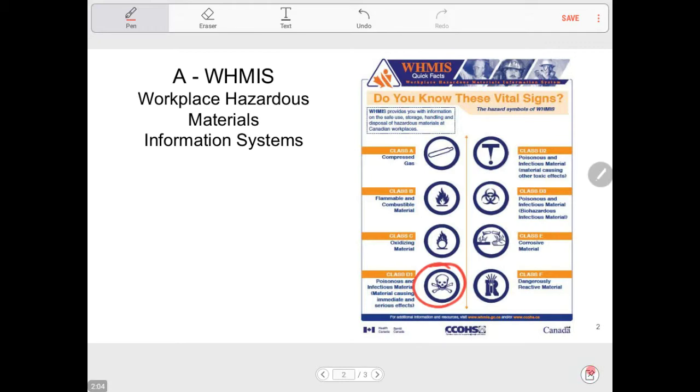So what I would ask that you know here is I'd like you to be aware of what the A-WHMIS symbols are and what they each stand for. In other words, if someone were to show you this symbol, you must be able to recognize that that is a compressed gas, okay, and so on and so forth. And if you want, go ahead and at home see what you can find, or take a look in your school, or ask other people what they work with on a daily basis. So please know what A-WHMIS stands for, why it's important, and be aware of what each of the 8 symbols mean.